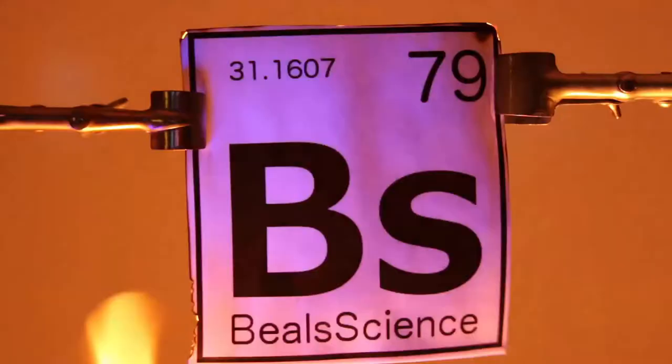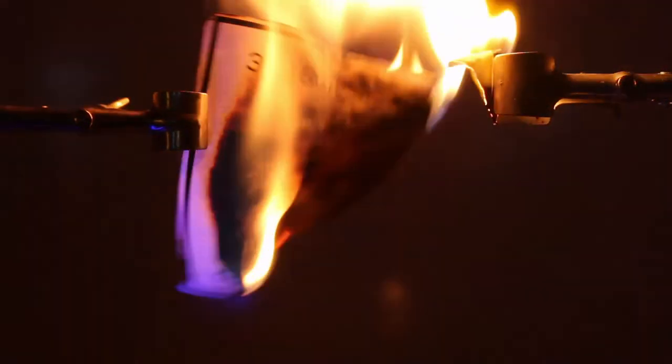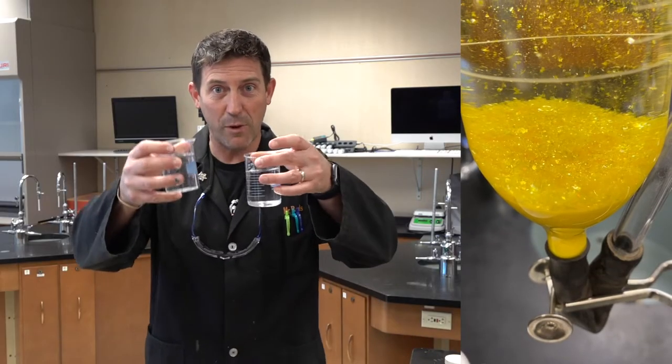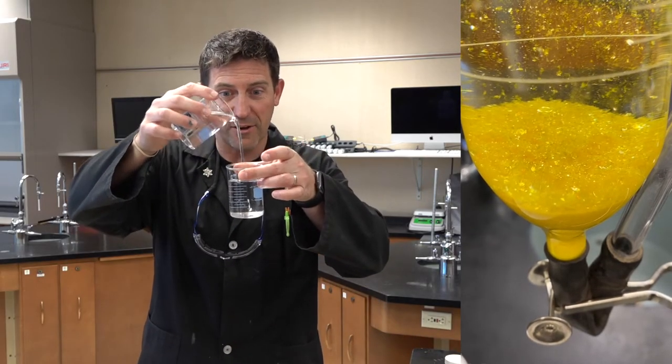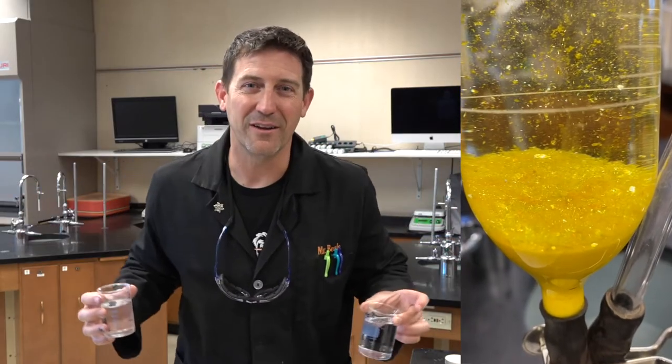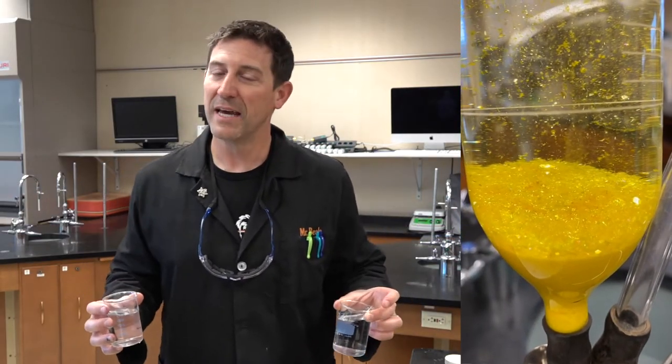Well hello! Welcome to Beals Science. I'm Craig Beals and today we're in the chemistry lab because I want to show you something that I think is quite magical. We're gonna take two clear liquids and when we mix those clear liquids together something magical is gonna happen — only if you watch this channel, you know it's not magic, it's science.